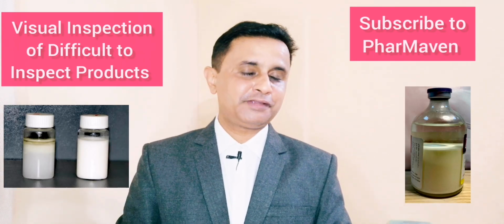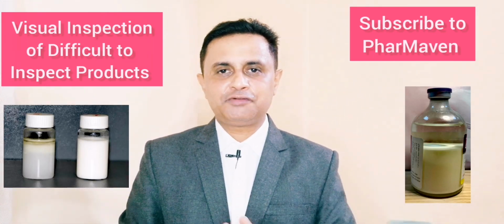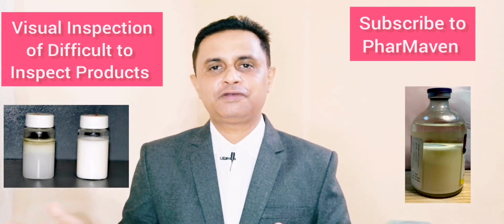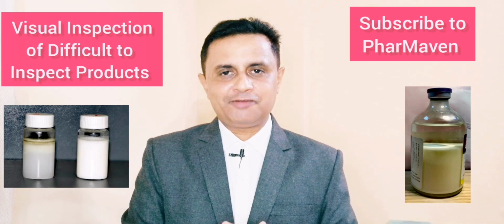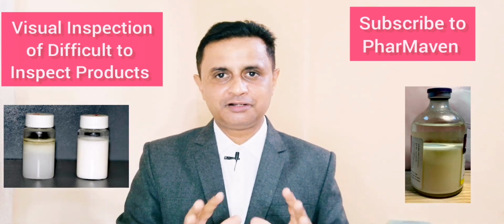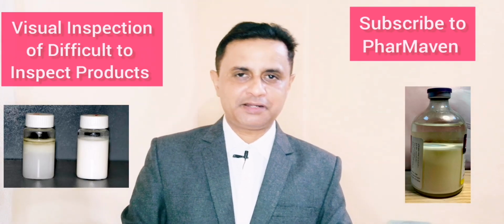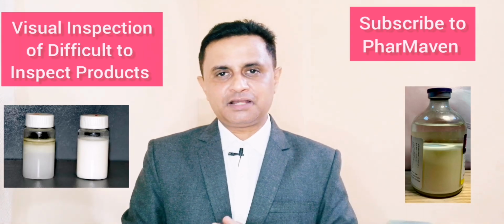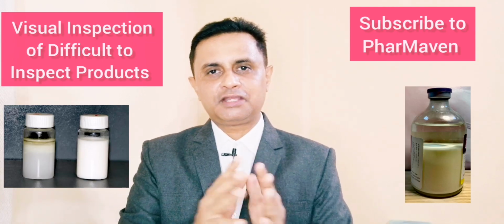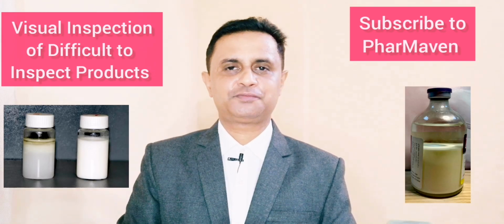For the suspension product, we collect a certain number of containers, as we said, 20 vials within the batch size range of 3,201 to 1.5 lakhs. The suspension should be diluted, made into a clear solution using the required solvents as per the product, and that container should be inspected for visible particles. For the emulsion, the same fundamentals can be used. If required, you can have certain special procedures, additional or extra lighting for inspecting such products.